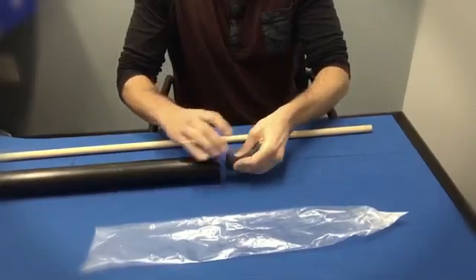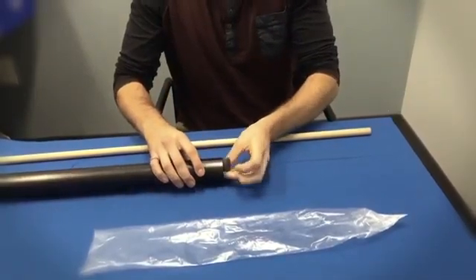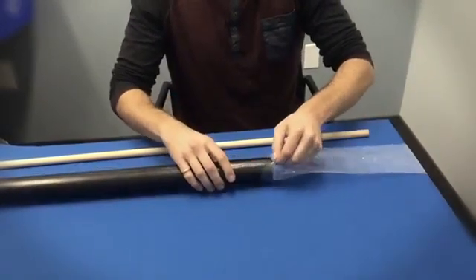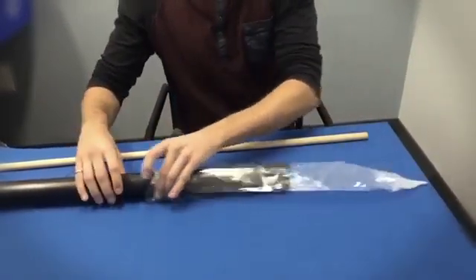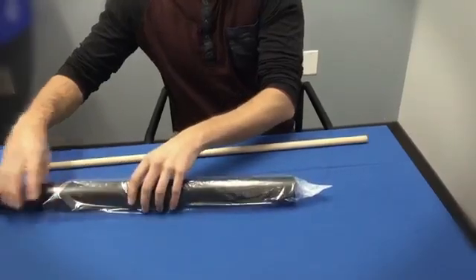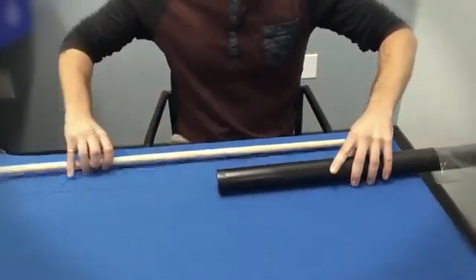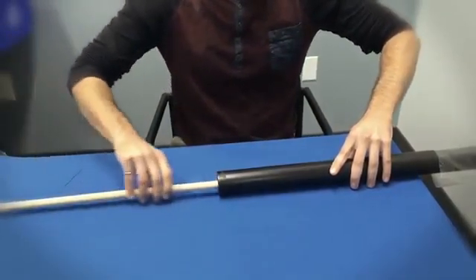Compress and insert the piece of foam into the PVC pipe. Place the pipe into the plastic sleeve, which should be the same diameter as the drill hole and sealed at the end. Place the dowel inside the pipe.